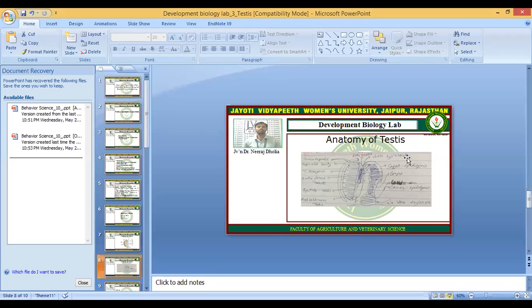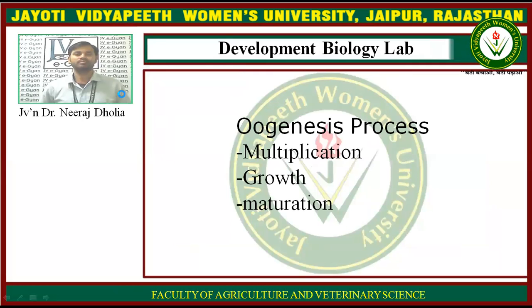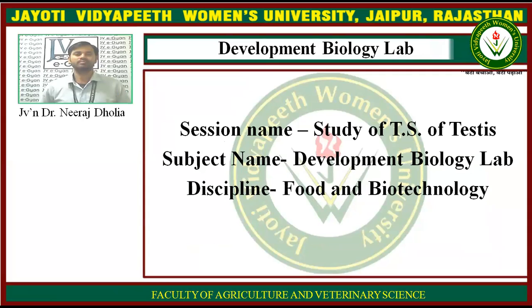So today we are here to discuss your practical session, the TS of testis. This comes under the subject Developmental Biology Lab, and this was incomplete in the previous lecture. So let's repeat the session and go ahead.